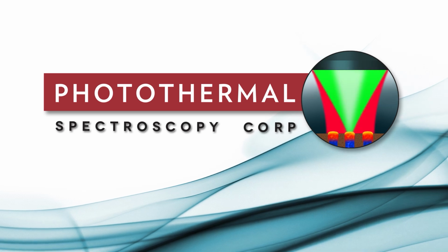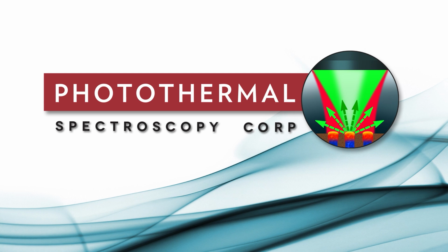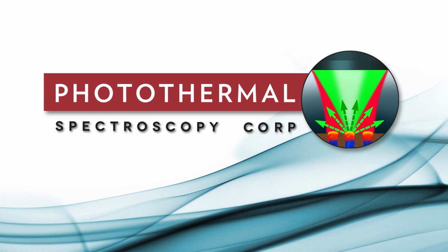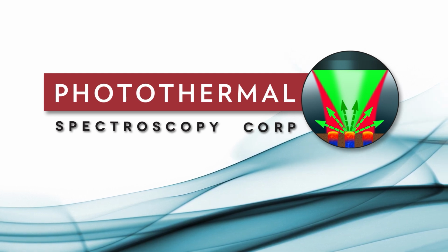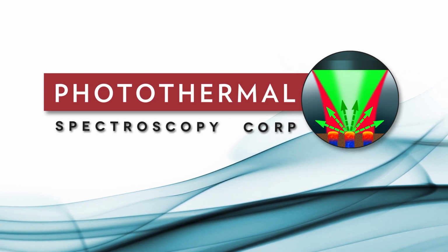Hi and welcome to our short recorded demo of the Mirage LS multimodal IR microscope, where we will perform an important life science related measurement. That is the automated IR spectral and imaging measurements of single bacteria at sub-micron spatial resolution.